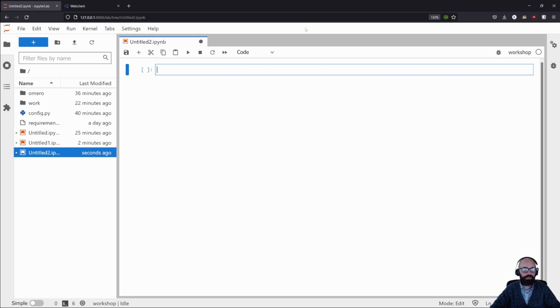Okay, so now we are going to start looking at the things we have created. So of course, this is just an example. If you already have an OMERO server with more things in there, feel free to look at those things instead of looking at the example things that we're looking at here. So we are going to start with where we ended the introduction section. So retrieving pixels of an image and plotting them.